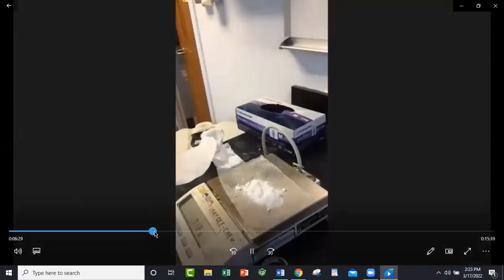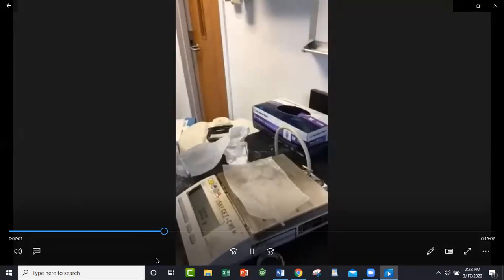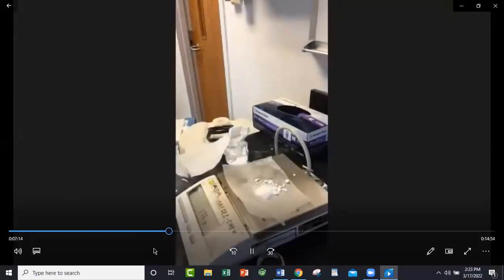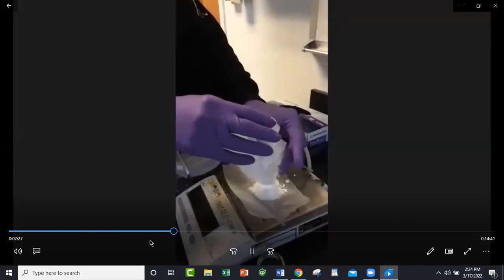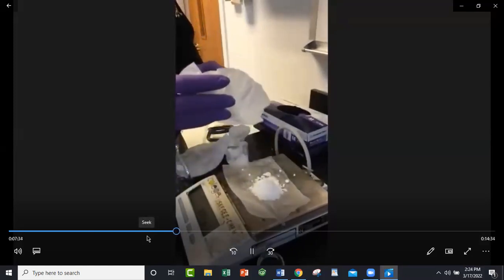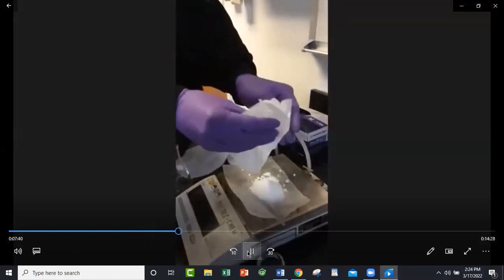I'm turning it down. If it looks clumpy and packed together, it's bad. But if it looks kind of powdery with a little bit of shimmer to it, that's a good sample. So this is the second sample? No, that's pretty powdery. If it's all stuck together and shiny though, that's crap. But these are all good samples though. It's gonna have a little bit of shimmer to it, but you don't want it to look like tinsel. You ever seen that little Christmas tinsel, the silver one? You don't want it to look like that. That's crap. That's gonna give you a bad yield because it's full of salicylic acid.